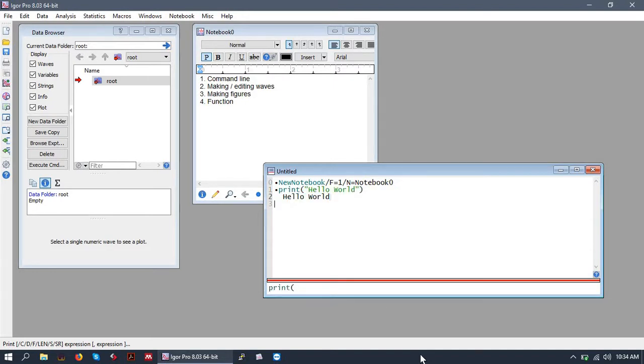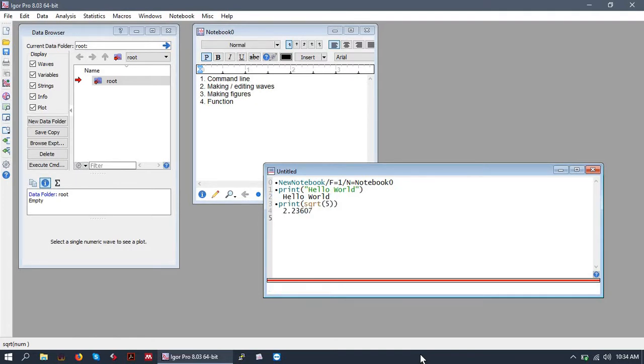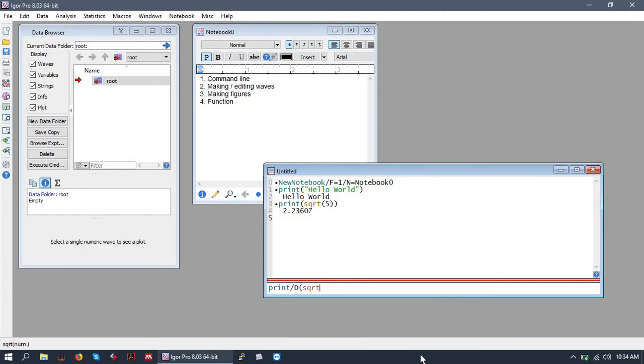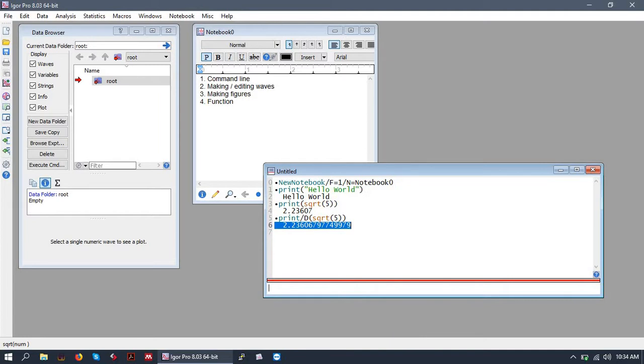We can also do some basic math like square root in the form of sqrt. And we get square root of five back. If we wanted more digits, we could use what's called a flag. Flags are very important in programming and scripting. So we'll give print the double precision flag so the output has much higher precision. And we get some more digits.